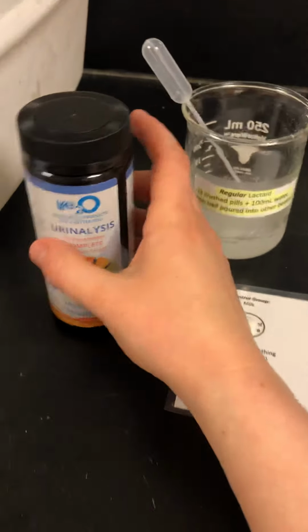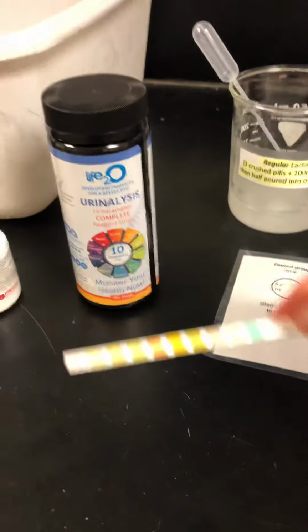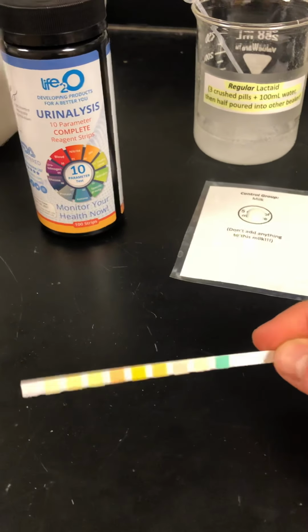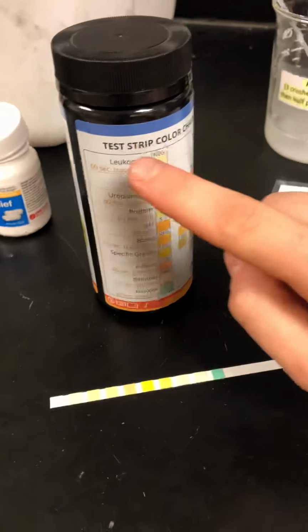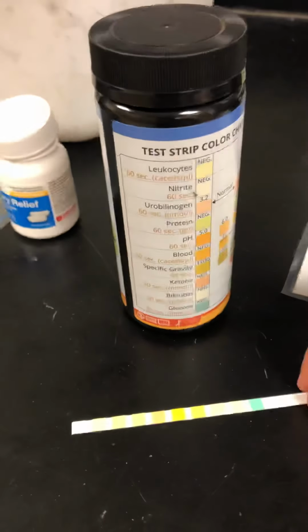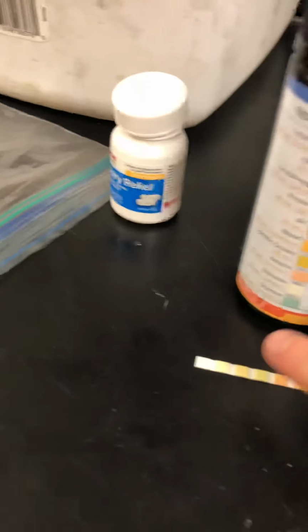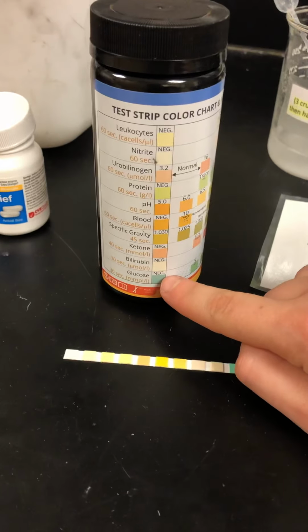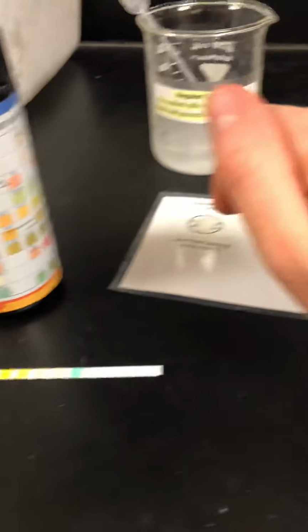In the meantime, I'll show you the test strips. So this is what the urinalysis test strip looks like. You can see there's all these little color pads on it, and on the back of the jar it tells you what each of them test for. So various things that at the doctor's office they would want to check to make sure they're hopefully not in your urine. Like if you had white blood cells in your urine, that would be bad. So we care about the bottom one, glucose. We're going to be finding out how much free glucose, just the single glucose monomers, is in our samples of milk.